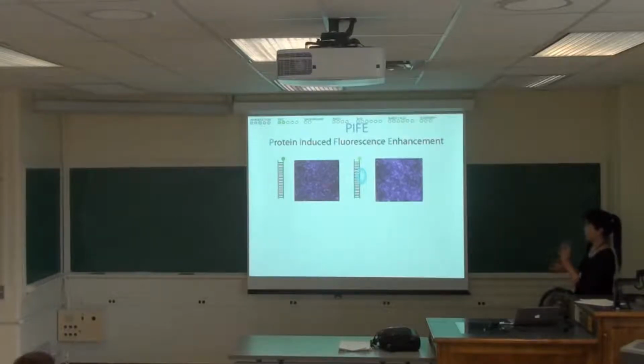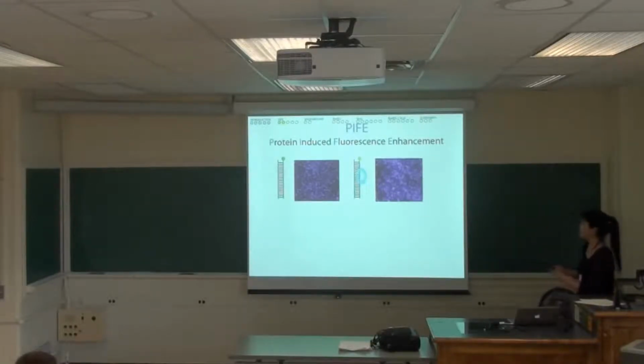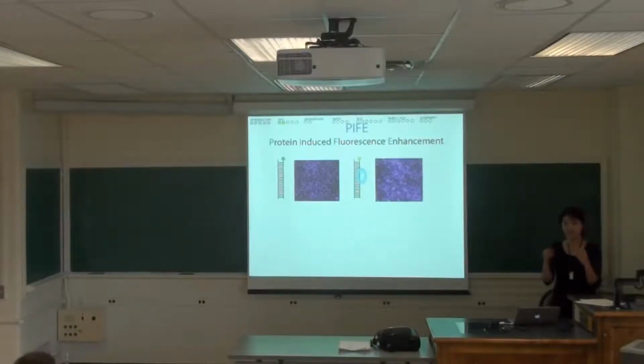So this is taken from another experiment, but this is a single molecule surface that we typically see on our computer screen. So you can see the intensity profiles of the fluorophore attached on the substrate, and as you can see, we detect several hundred molecules per movie, per image. When you add protein to the substrate, you can already see that the fluorophores become much brighter. And with naked eyes, you can see the molecules becoming much, much brighter.